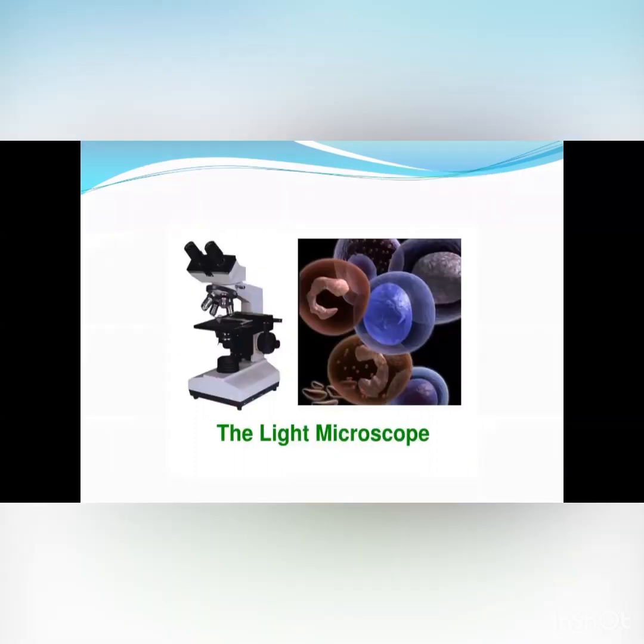So this image is a kind of light microscopy, as you see here, and as we discussed, there are different kinds of light microscopy that we talked about today. I hope you will enjoy our next microscopy lectures. For the next one, I'm going to talk about transmission electron microscopy, or TEM.